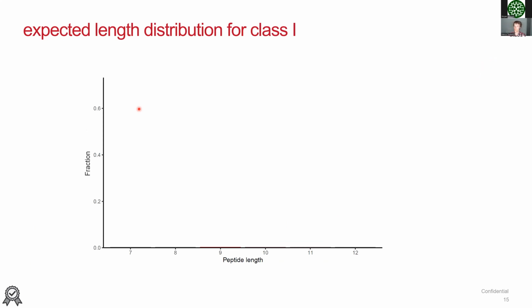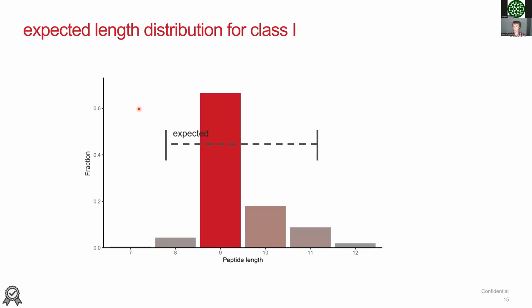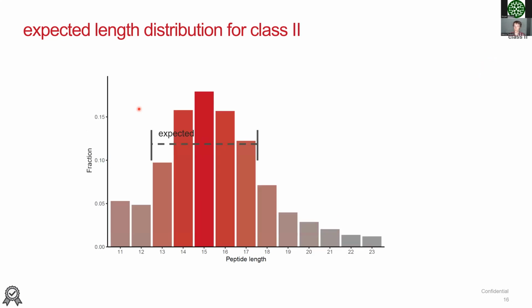So the reproducibility is very high. What you can also look at, and we discussed in the introduction, is the fact that peptides have very clear physicochemical properties due to the fact that they are bound by these specific HLA molecules. For the class 1, we know to expect peptides that are between 8 and 11 amino acids in length and have a very sharp peak at 9. And this is indeed what we found. For class 2, this is a bit different. As we discussed, the peptide length is a bit broader, and indeed we find peptides that are mostly 15 mers, but the peak is also a bit broader than for the case of class 1.